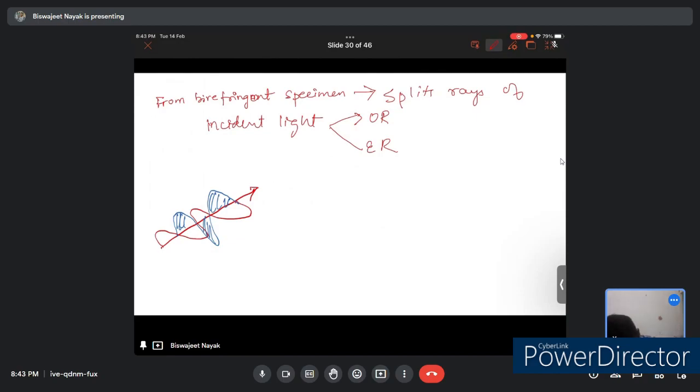So here we can say the ordinary ray and extraordinary ray which are formed comprise each ray or wave bundle as they become mutually shifted in phase, because of the different refractive index each wave experiences when it passes through the specimen.